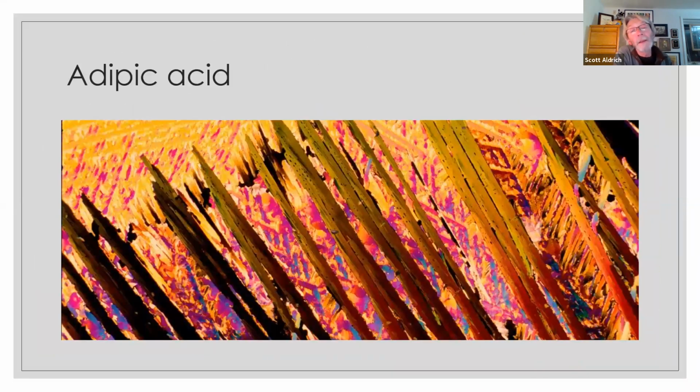So, art. This is called a fusion prep. And a fusion prep is simply taking a meltable material and melting it quickly between a cover slip and a glass slide, and then letting it freeze and examining it for its effects.